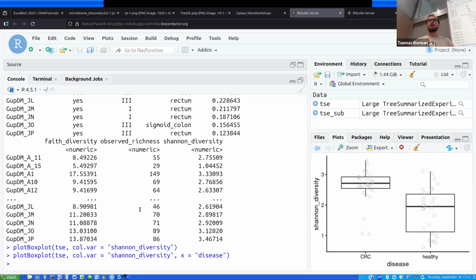Yes, so it's kind of like a principal component analysis, but now we can specify the dissimilarity metric. Principal component analysis uses Euclidean distance, but usually in the microbiome field we want to apply, for instance, Bray-Curtis dissimilarity. We can do that, but then it's called principal coordinate analysis. Very similar, but only the name differs.